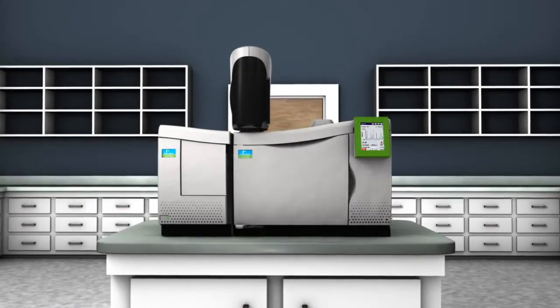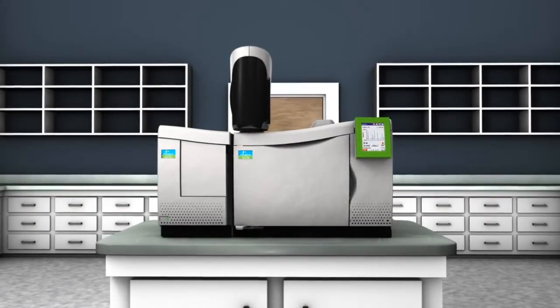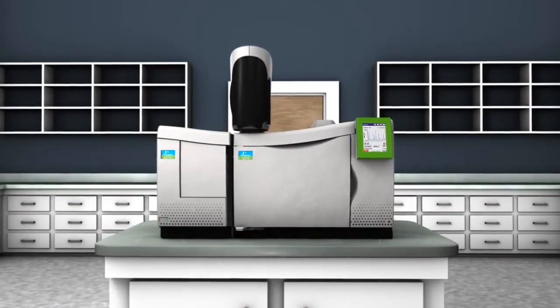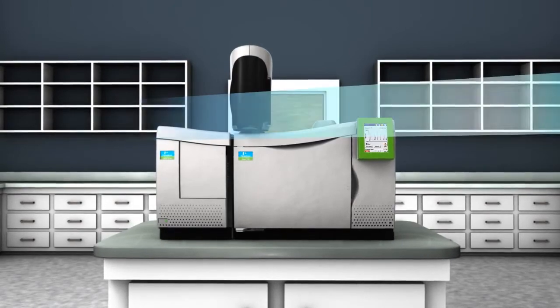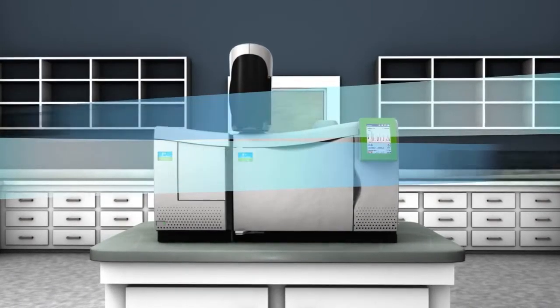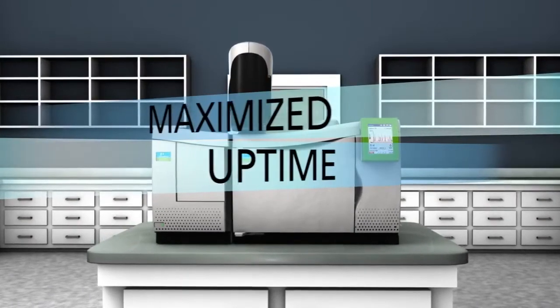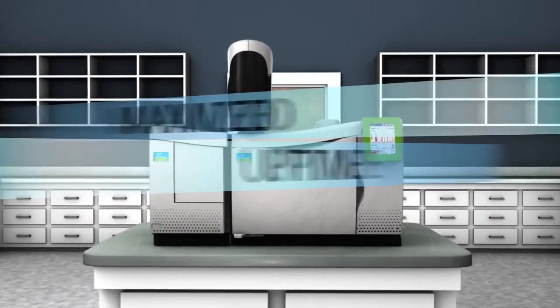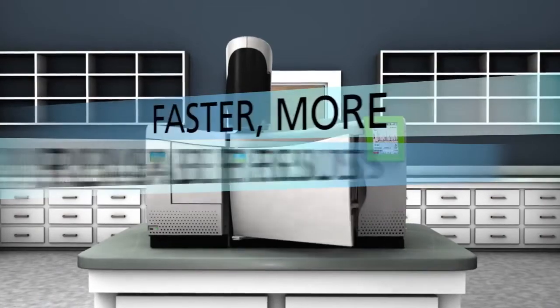Together, they form an advanced GC-MS system that minimizes maintenance, maximizes uptime, and provides faster, more reliable results.